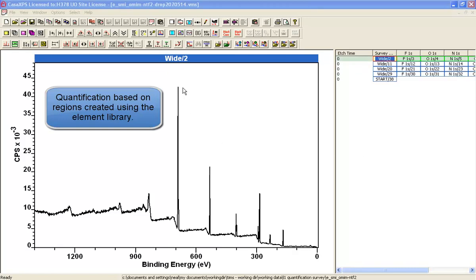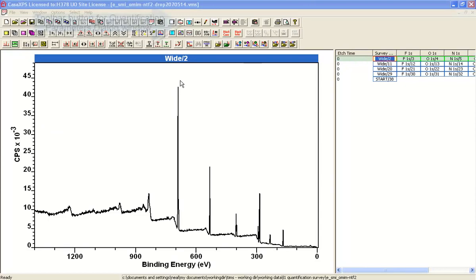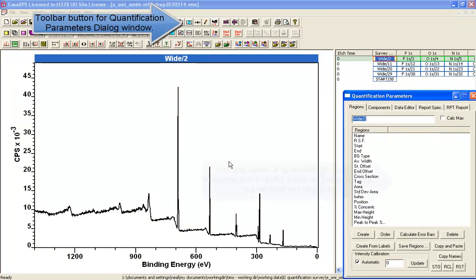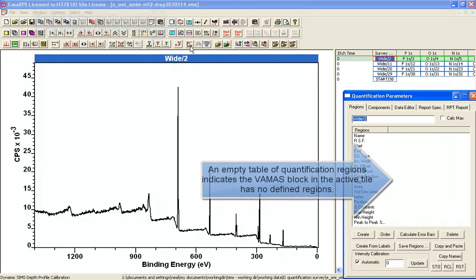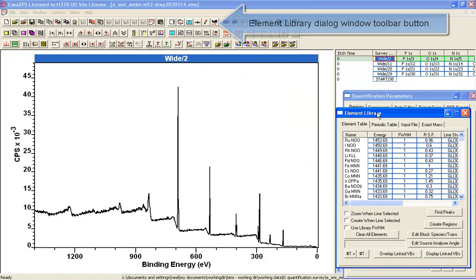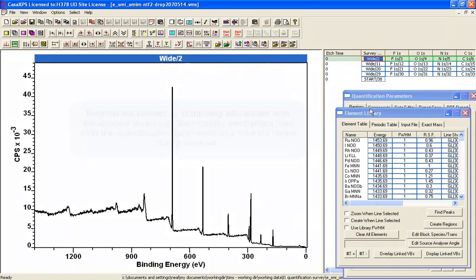While it's possible to manually create regions using the Quantification Parameters dialog window to quantify a survey spectrum, what we'll do now is look at the element library and how to manage the creation of regions based on the element library.